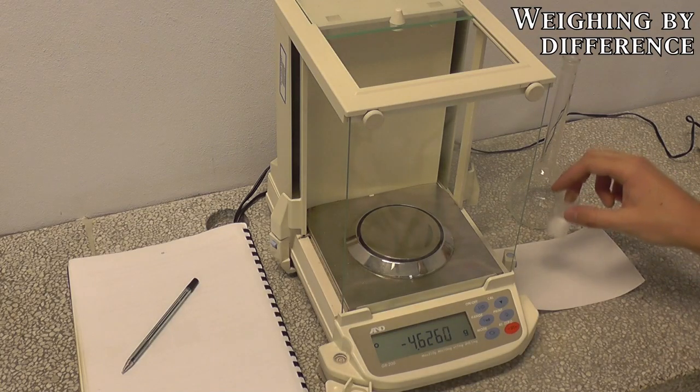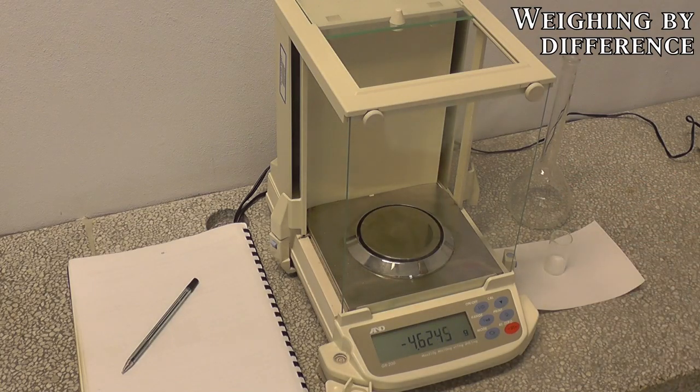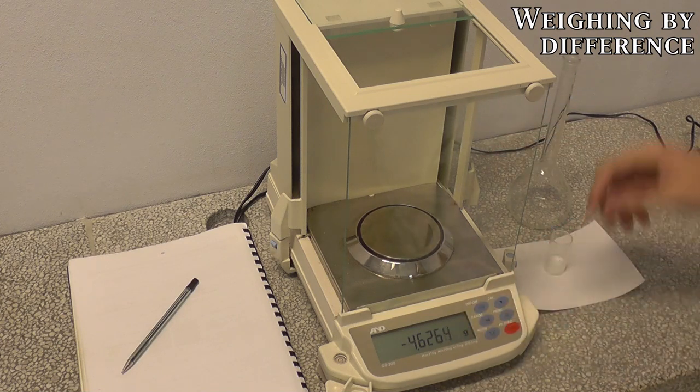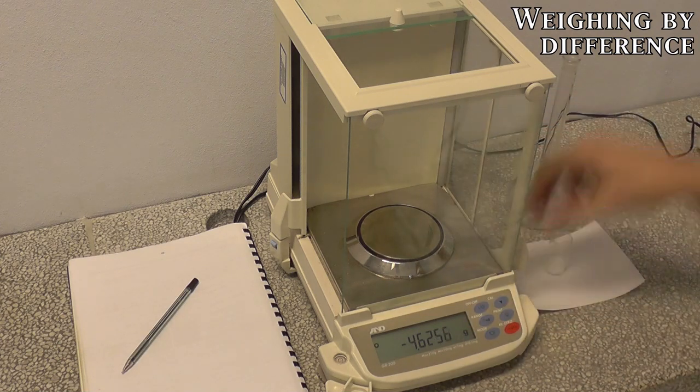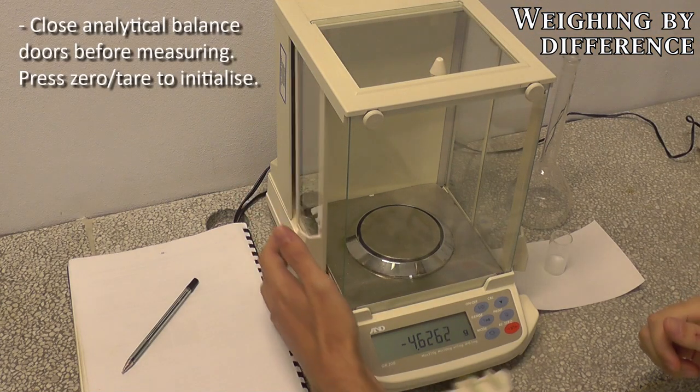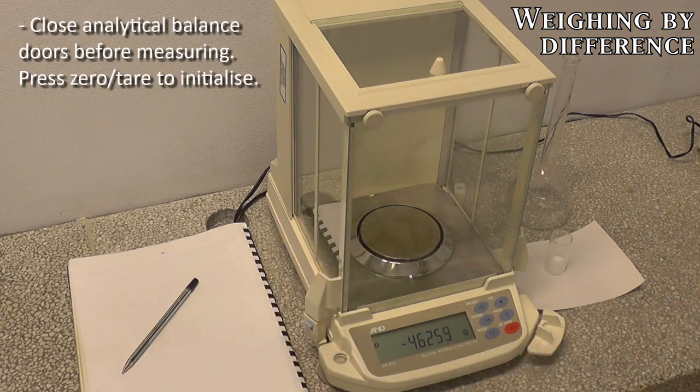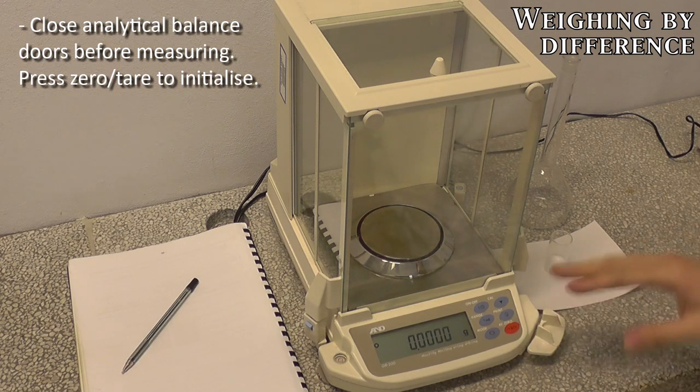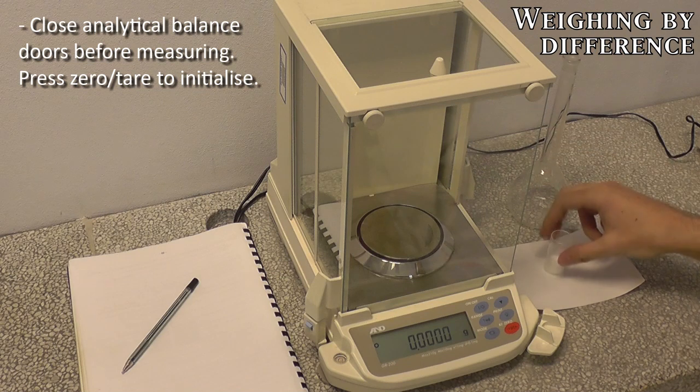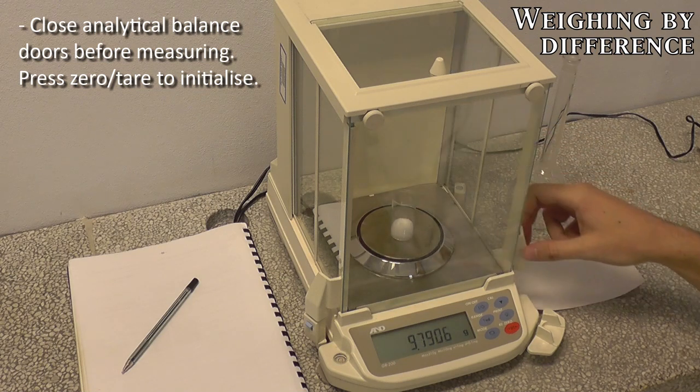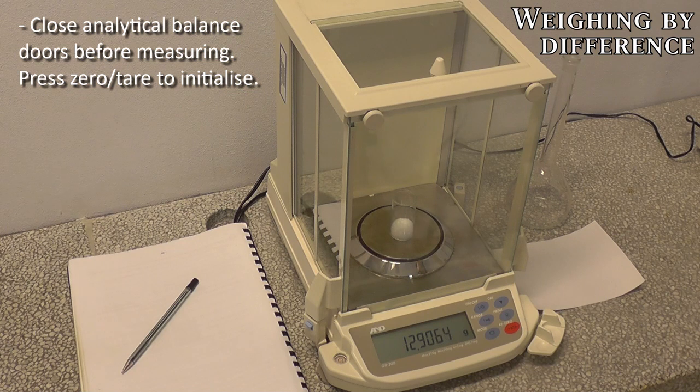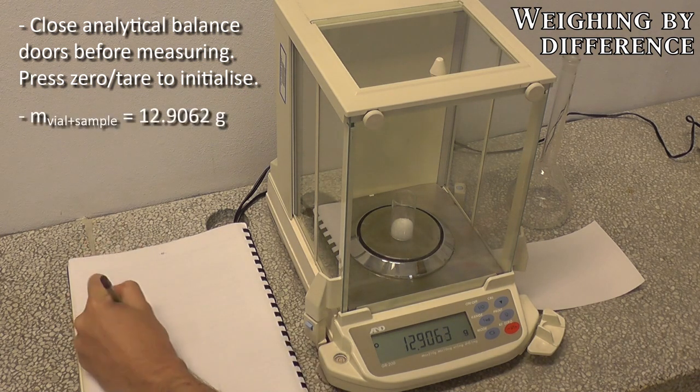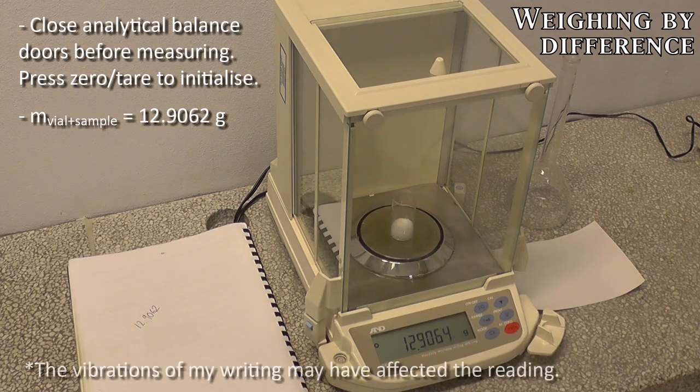Next we bring our sample over to the analytical balances. These are very sensitive scales that are even detecting the microchanges in air pressure. You'll see that they have several doors, and it's a requirement that you close all of them before you start any measurements. When you come to the analytical balances, the first thing you want to do is re-zero the scale, or tare the scale, and once that's done, we can stick in our sample. The first mass we're going to record is the mass of the vial plus our total sample, which in my case is 12.9062, and I'm going to write that number down. Don't worry if this number fluctuates, that's not too important.